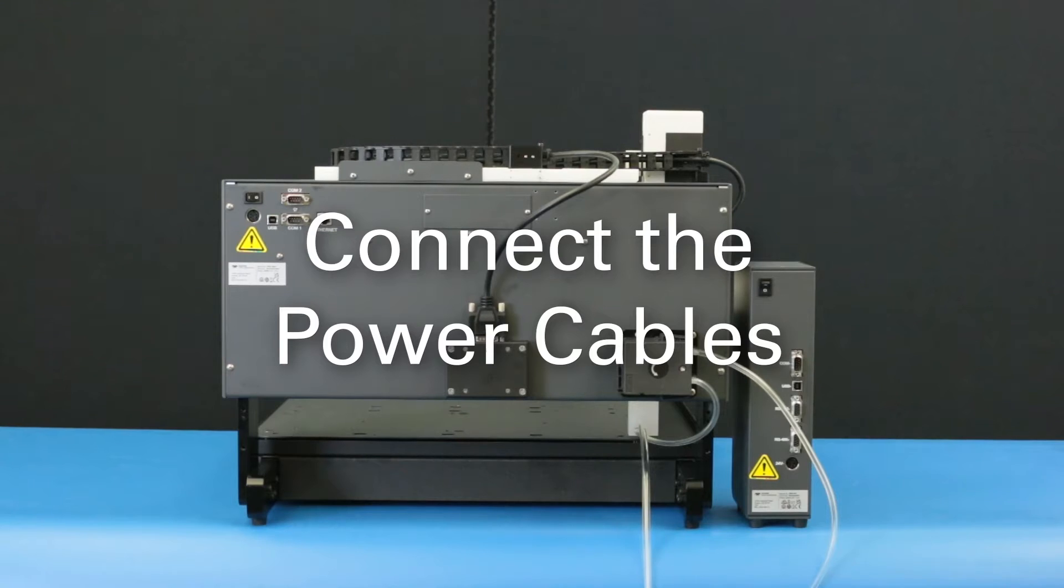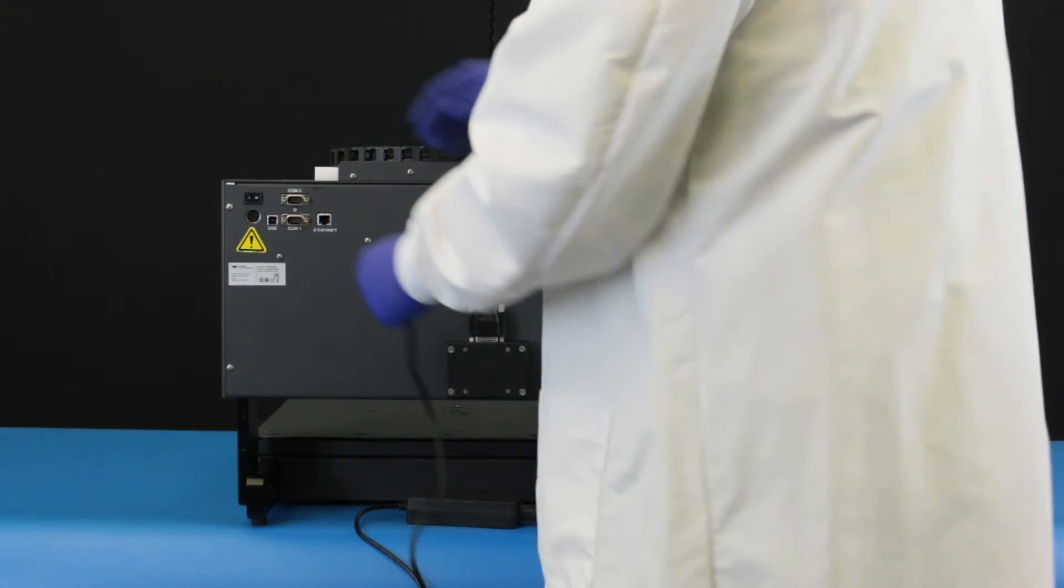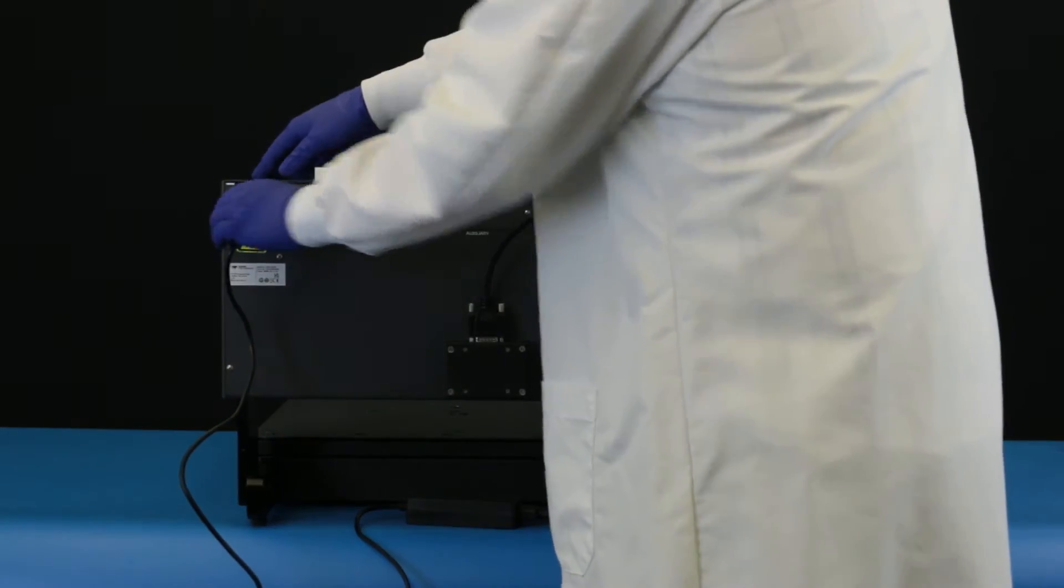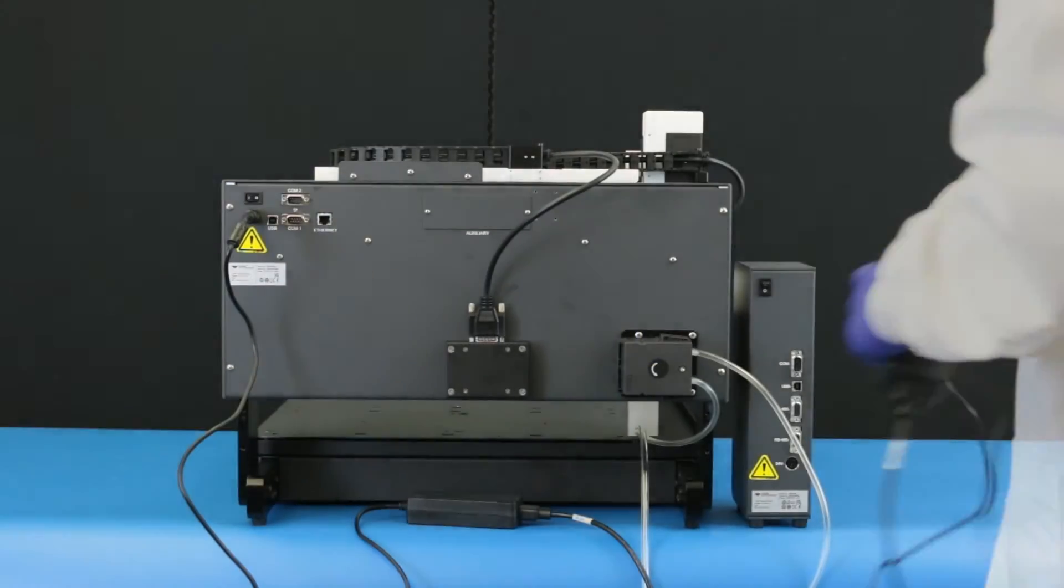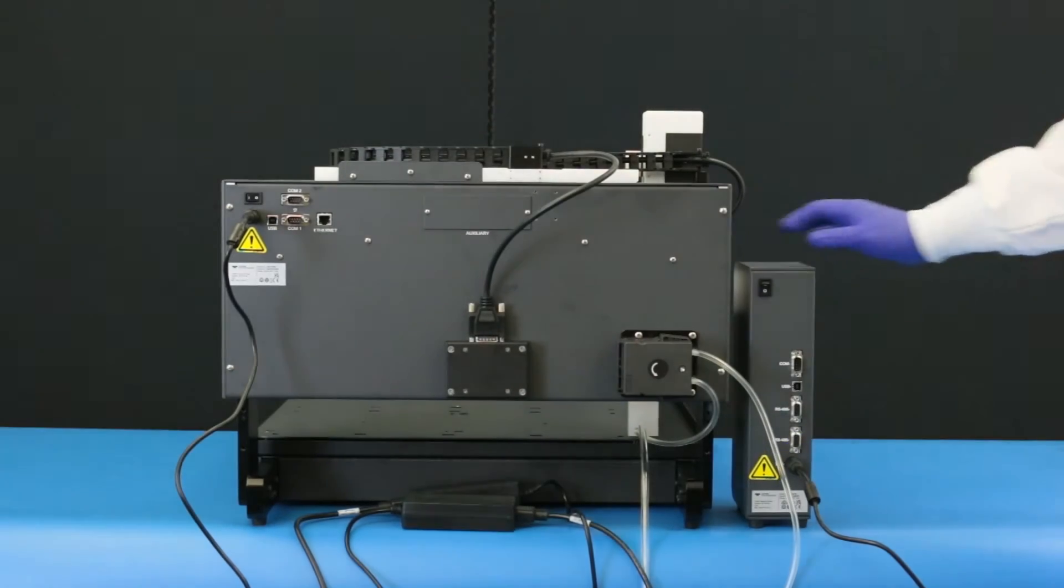Connect the power cables. Be sure the power switch on the autodiluter is off. The two power supplies are identical. Plug one power supply into the power connector on the autodiluter. Plug the other power supply into the power connector on the syringe pump module.